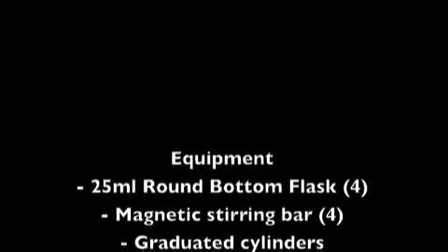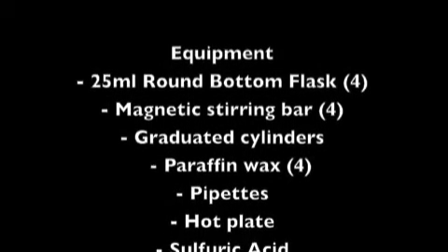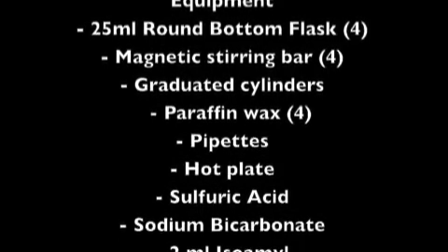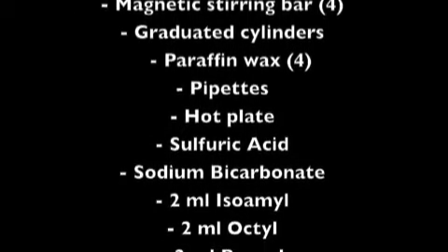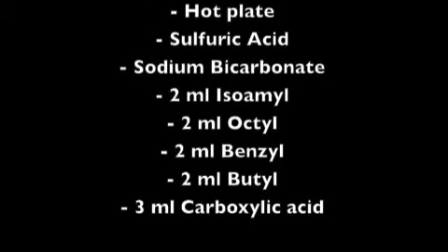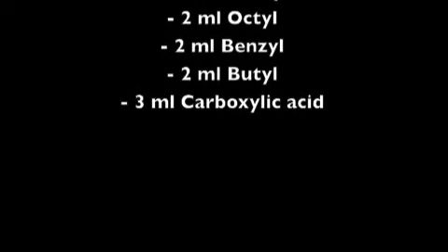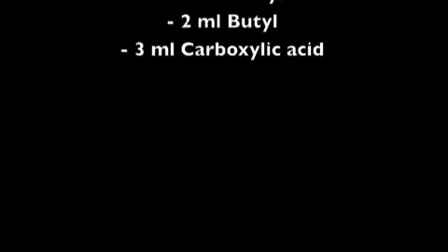For our lab, we had four 25 milliliter round bottom flasks, magnetic stirring bar, graduated cylinders, paraffin wax, pipettes, a hot plate, sulfuric acid, sodium bicarbonate, and 2 milliliters of isoamyl, octyl, benzyl, and butyl, as well as 3 milliliters of carboxylic acid.